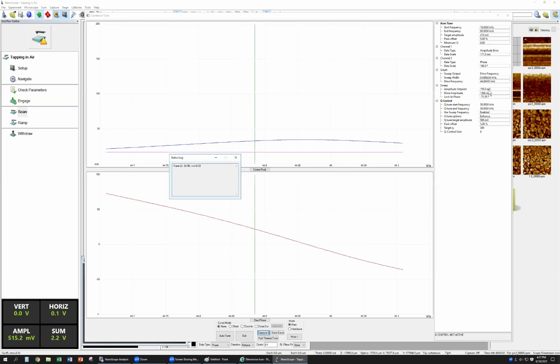Then here is the calculate. Okay. So you just click calculate, and it gives you 0.726. Okay. So this k value is 0.7. Then the box gives you 0.9. So that means for this probe it's 0.7 only. It's not 0.9. So you got this data from these two methods. One is thermal tune, one is the SET method. Okay. So this is the k.